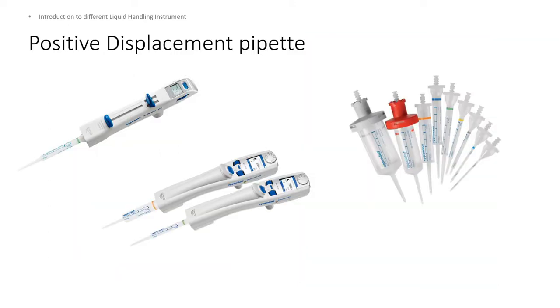This one is the positive displacement pipette, a type of pipette that operates via piston-driven displacement. Unlike an air displacement pipette, which dispenses liquid using an air cushion in the pipette tip, the piston in a positive displacement pipette makes direct contact with the sample, allowing the aspiration force to remain constant throughout. In the positive displacement principle, the piston of the tip is in direct contact with the liquid without an air cushion. Contamination of the pipette is prohibited with this one. If you see, the tip is bigger and it is a side ridge type, unlike the air cushion one, which is very small.